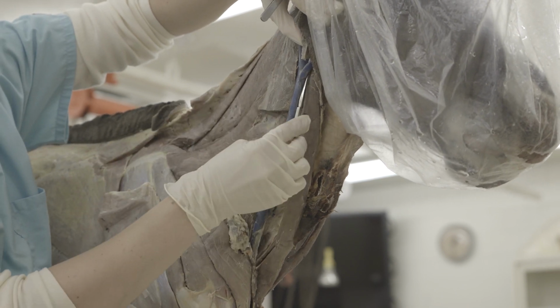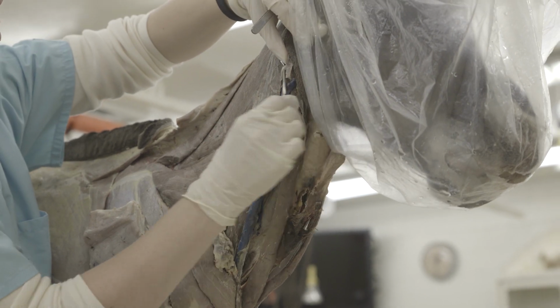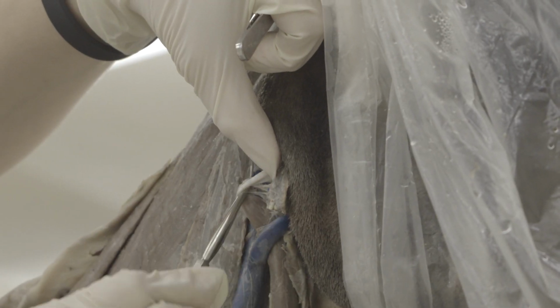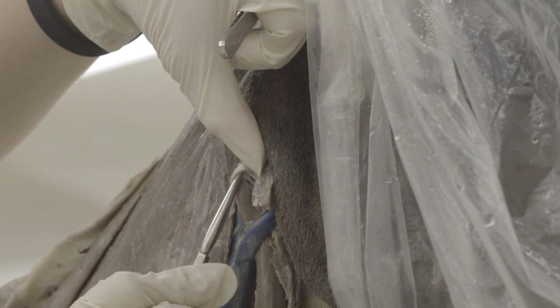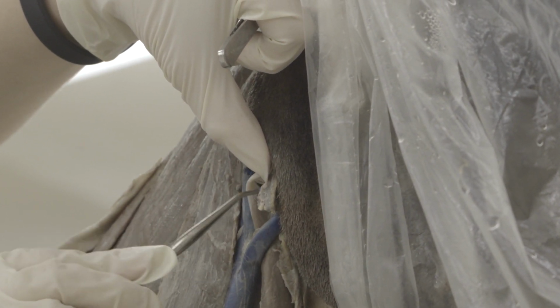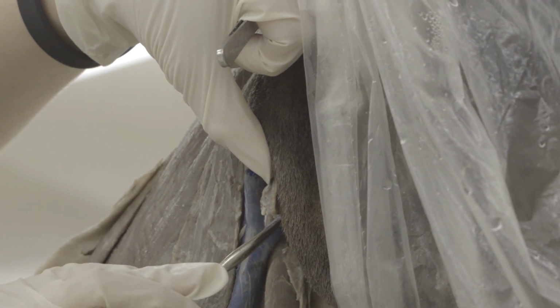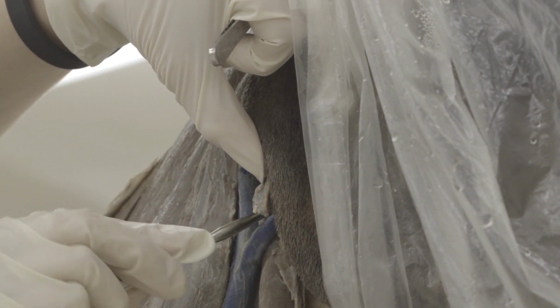So here we have the muscle coming up, and I'm going to try and pull that tendon out so you can see it there. So there's the tendon of the sternomandibularis muscle, and that forms that dorsal border of that Viborg's triangle. So Viborg's triangle is right here, in between that tendon and this linguofacial vein, right there.